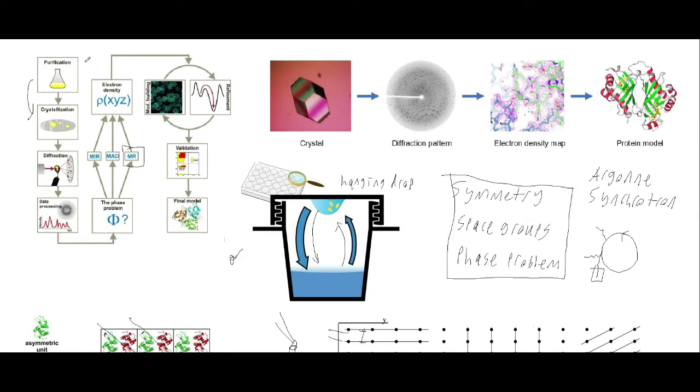So I talked about how to obtain a crystal structure, we first purify our protein. There are various different ways you can purify protein. There's crystallization, and I did not go in depth in crystallization either. So I sort of just talked about this hanging drop method.